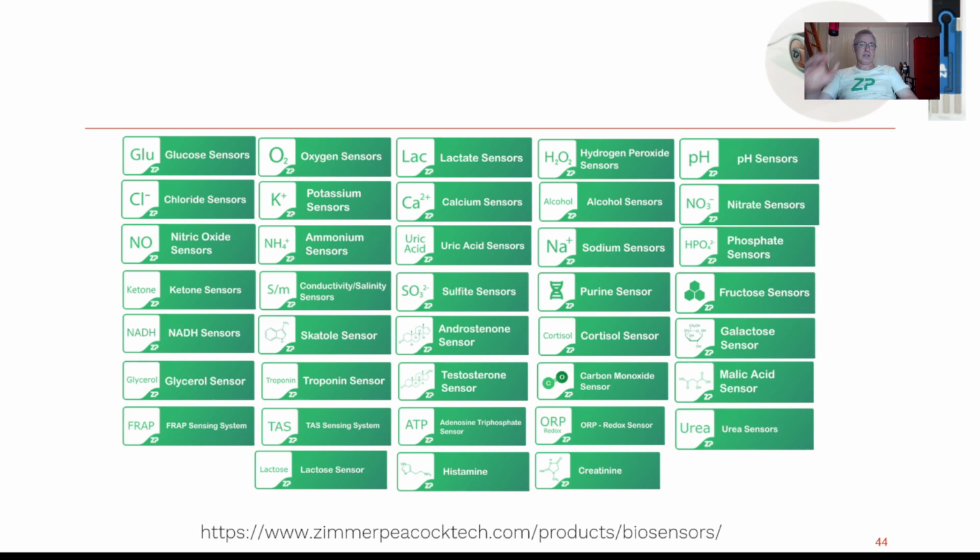My advice is, if you're commercial and you're thinking about making a commercial product, you've got continuous monitoring, and you've got discrete testing or spot testing, where you just take a sample, get a result, done. Honestly, have a roadmap where you just do the discrete spot testing before you get into the complexity of microtiter plates, or before you get into the complexity of continuous monitoring. I mean, this is a continuous monitoring system. You could argue that this is more challenging than your bioreactor, or rather measuring alcohol maybe in a fermentation, but it's still a challenge. And I would generally argue that if you were trying to do 96 well alcohol sensing, you were talking about hundreds of thousands of dollars worth of development just to get to a prototype phase.